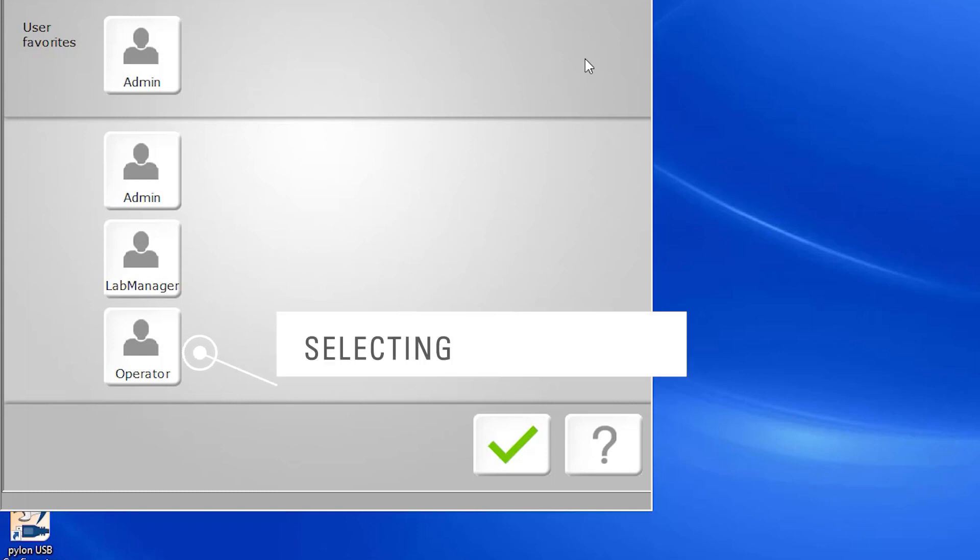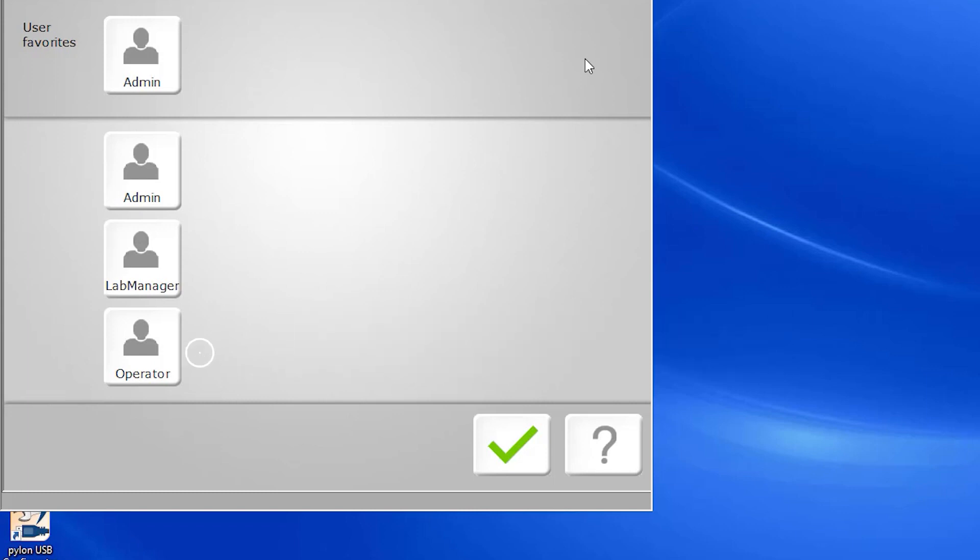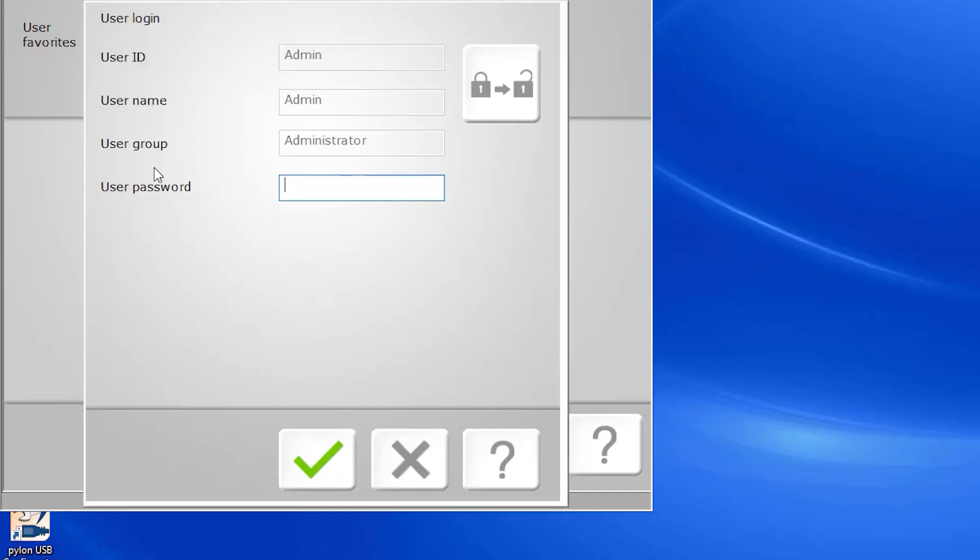or as an operator, which has standard access that is limited to selecting and measuring products. While we typically recommend running the Tango GUI as an operator so that program settings aren't accidentally altered, for today's purposes, we're utilizing the GUI via administrator access so we can see all the available functions.